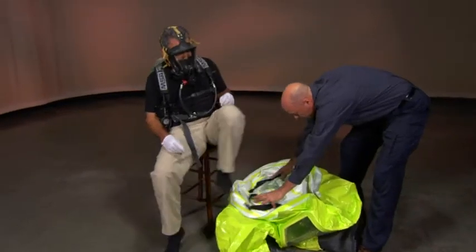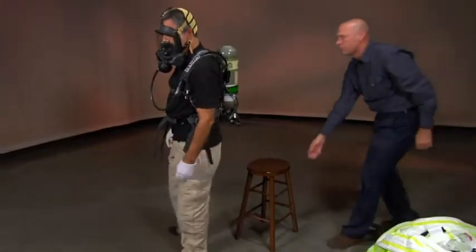Continue to roll the suit inside out to the wearer's ankles. Carefully have the wearer step out of the suit as the doffing helper removes the suit.